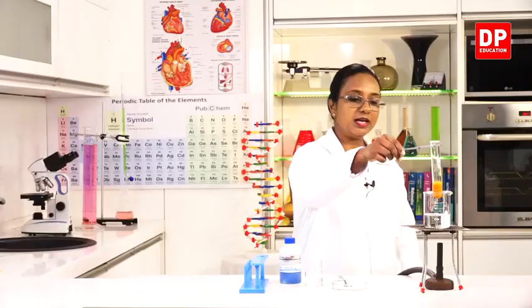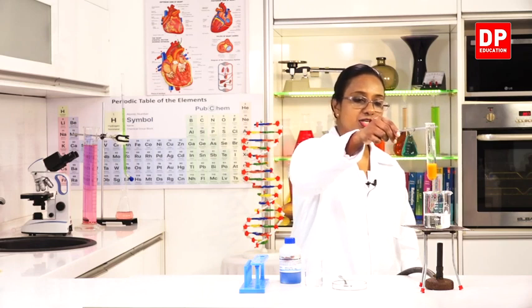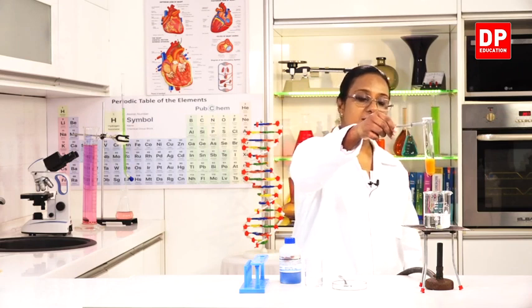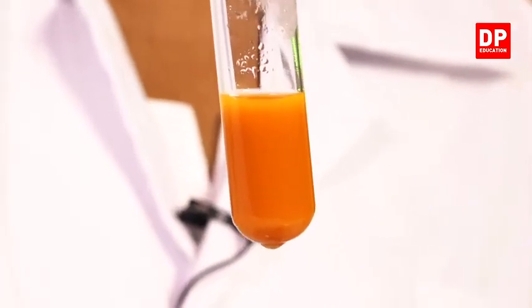Now you can see the color change clearly. The solution has become brick red in color and the precipitate will deposit at the bottom of the solution.